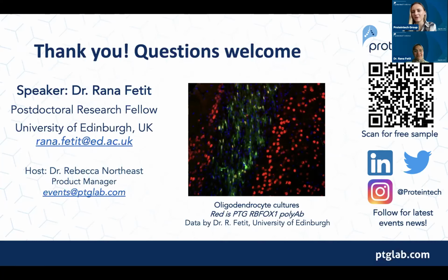And then one last question, which some other people might be thinking, is someone's asking for a written protocol. So perhaps when we send out the follow-up email, are there any general publications that you're following that we can send these people for the written protocol? Yeah, there are the two main ones that I've cited in the paper. Both protocols are published. The one where the majority of the protocol was in adherent culture, and the other one, which I've described here, that is in suspension. So the two papers I've cited in the presentation are the ones you can have a look at. Okay, great. And are you okay if we send these slides to everyone? Of course, yeah. Okay, so everyone will be able to get the slides and the recording, and the papers with the protocols will be in those slides.